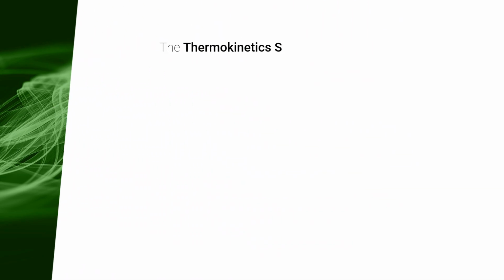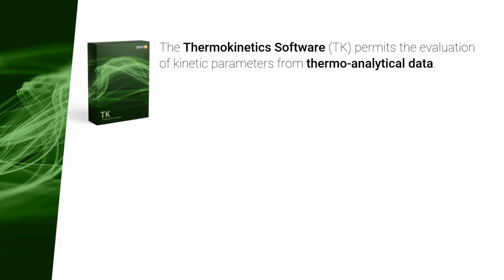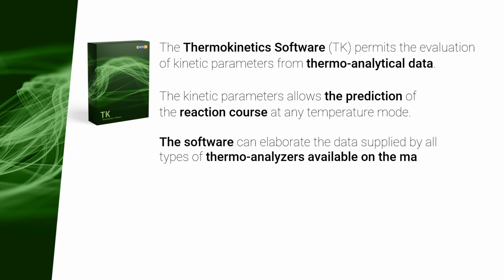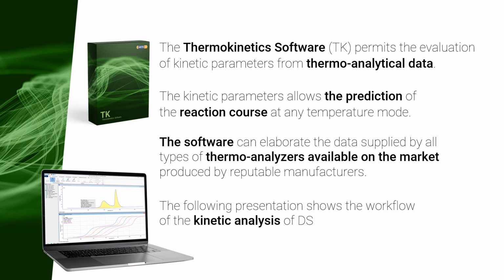The Thermokinetics Software, TK, permits the evaluation of kinetic parameters from thermoanalytical data. The kinetic parameters allow the prediction of the reaction course at any temperature mode. The software can elaborate the data supplied by all types of thermoanalyzers available on the market produced by reputable manufacturers. The following presentation shows the workflow of the kinetic analysis of DSC data collected in non-isothermal conditions.